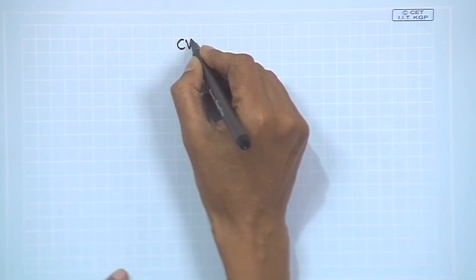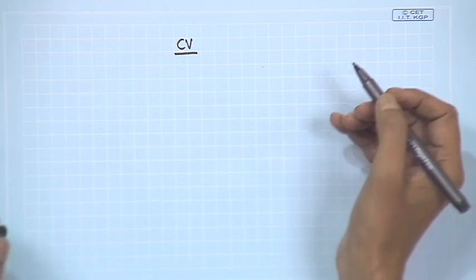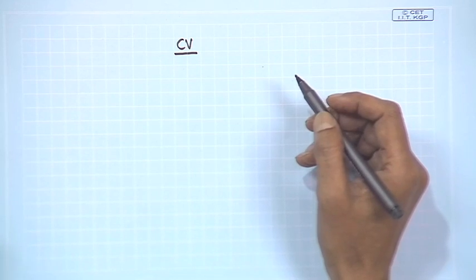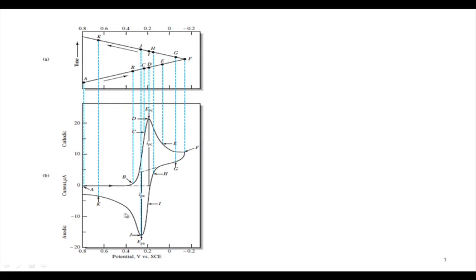Hello, good morning everybody. We are talking about a process which we can consider as a cyclic one, where we are considering this as cyclic voltammetric analysis. So, how can this particular electrochemical method be helpful in identifying the nature of the analyte and its electron transfer properties? What we have seen so far is how you can draw this.